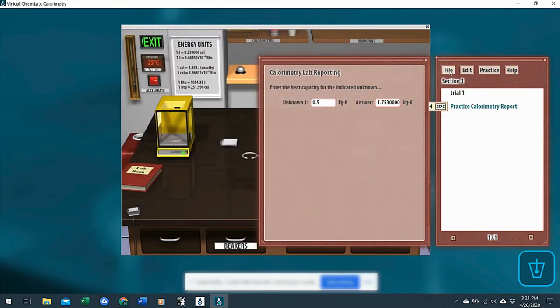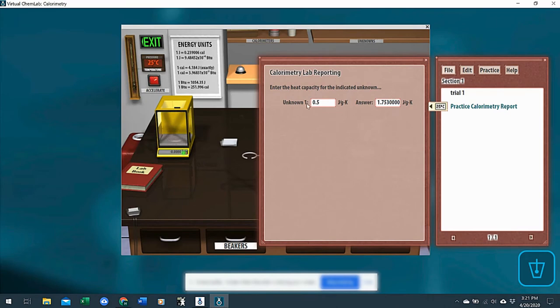And then they can send it to you through your email program or your LMS, whatever you'd like. So then you can see what the actual value is, what their guess was for that metal.